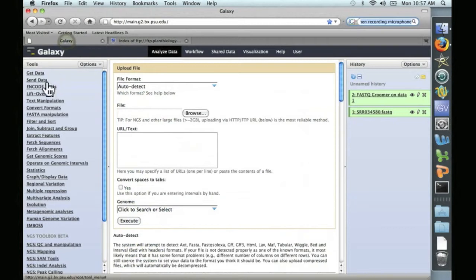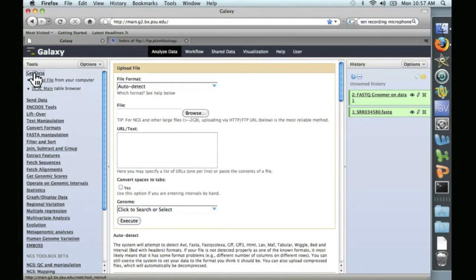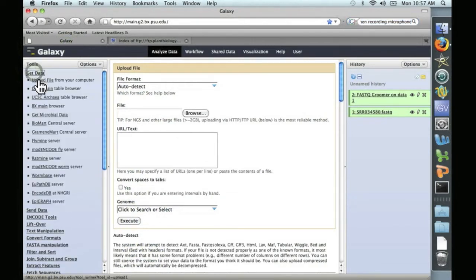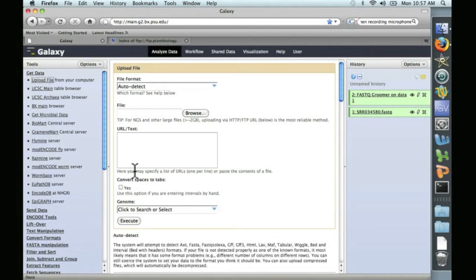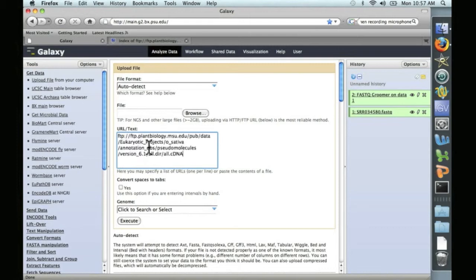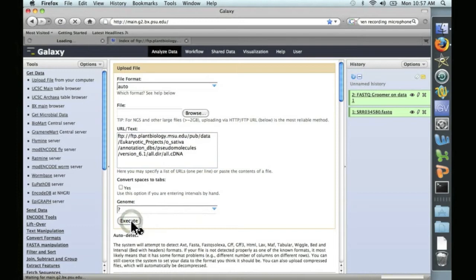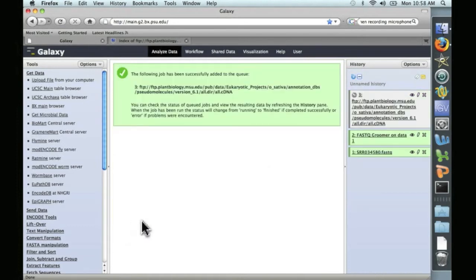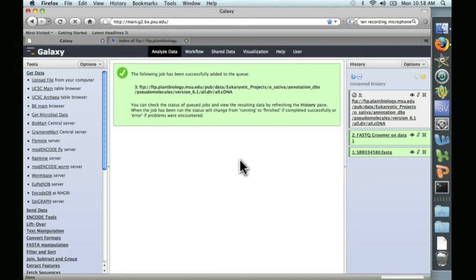Go back to Galaxy. And we're going here on the left to Get Data and Upload File from your computer. We'll go ahead and paste in that FTP and let it rip. And you can see here that the job's been queued and we'll come back when it's finished.